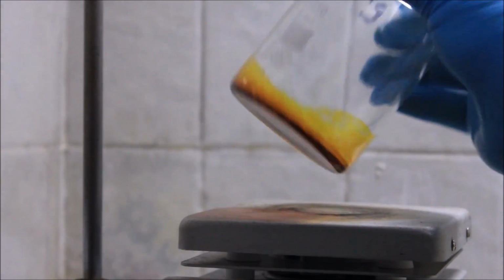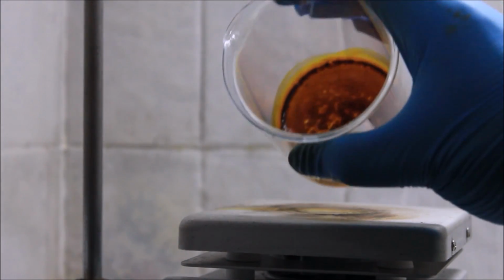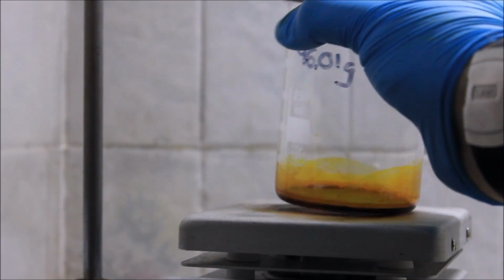The crude mixture could be separated into its main components by running a column chromatography. The final yield was 1.10 grams.